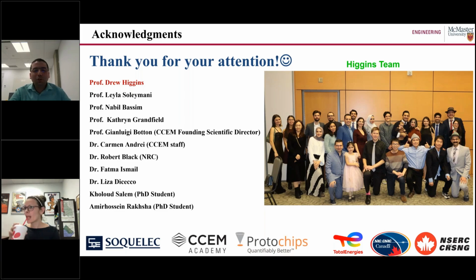Yeah, that's a great question. So for sure, before you conduct any in situ TEM, you have to do tests outside the microscope to be sure you have the correct flow rate and the correct pressure, so that you don't have any leakage under this condition. And you can just use a very simple technique, like I use the light microscope to visualize what's happening in these two silicon nitride windows before I put it under the in situ and under the TEM high vacuum, to avoid any leakage or contamination to your TEM machine.